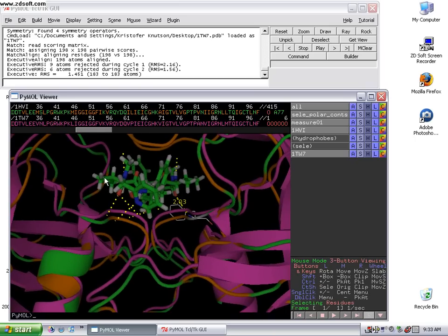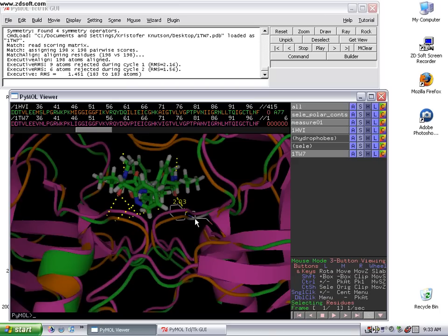Let's say we wanted to zoom in on the mutation we made and make a publication-quality image of that. Let's go to that region. Here's that tyrosine we mutated a few videos back.